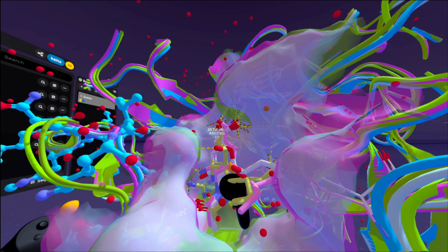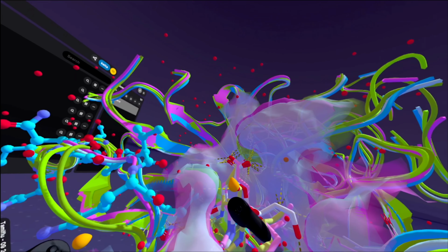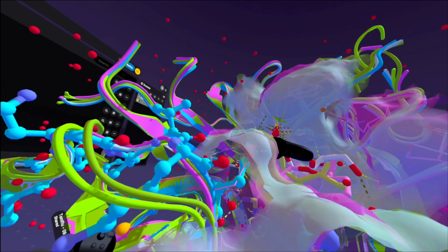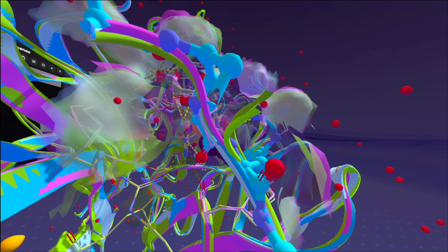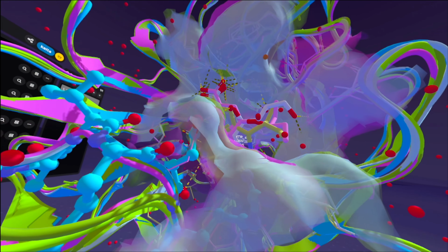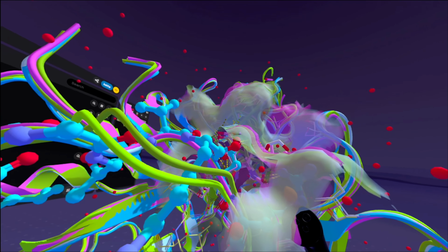And as you can see, all of these drugs that target the group 2, they're in a group 1 protein at the moment, but they don't really interact with any of these 150 loops. We do have a little bit of interaction here with these 2 residues, but other than that, this loop isn't really gone after because they didn't know that they should.